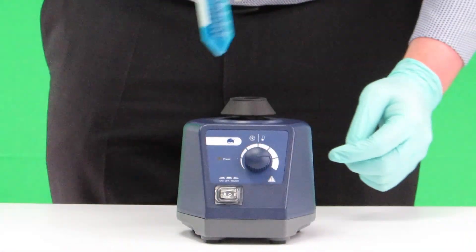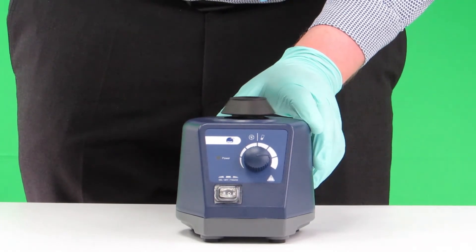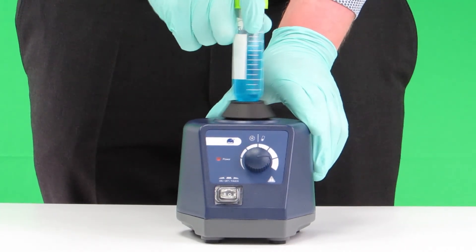The second mode only operates when the tube is pressed down into the vortex cup as shown here. This allows the unit to be kept switched on throughout the day without having the mixer constantly moving.